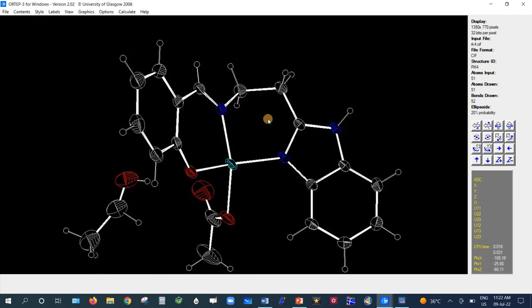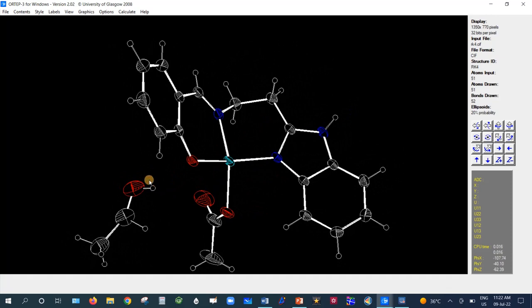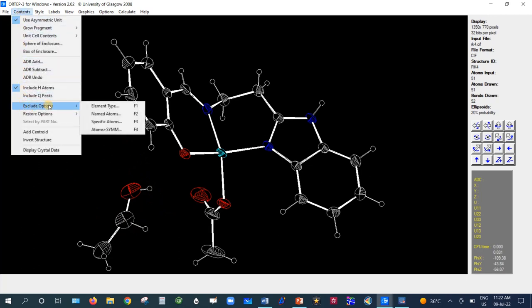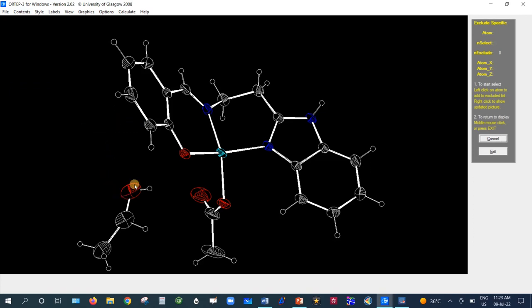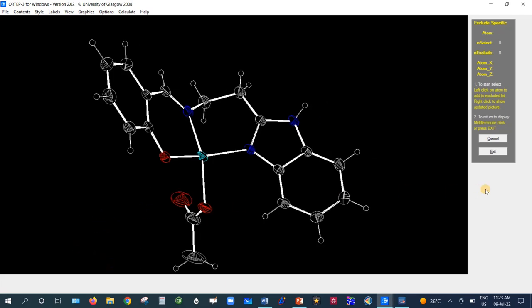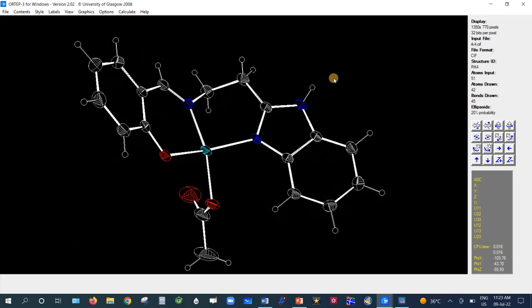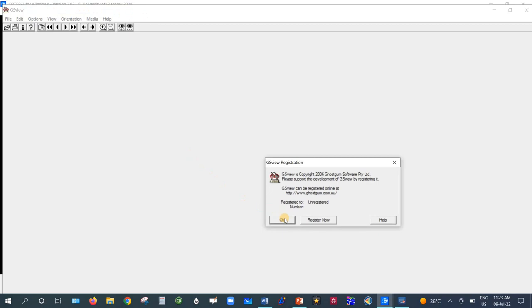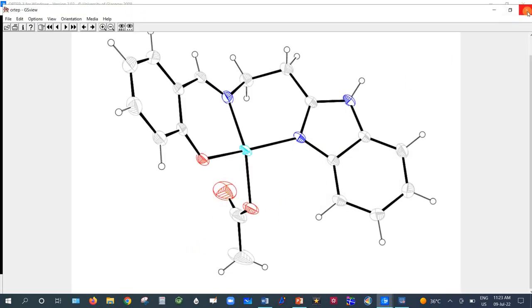Sometimes we want to exclude certain atoms from the molecule display. For example, if there is a solvent ethanol molecule you don't want to display, go to Content > Exclude. You can exclude by element type or by named atom for specific atoms. Left-click to select an atom, then right-click to exclude it. After pressing Exit, the excluded atoms are removed from the diagram, and writing a new PostScript color file confirms the ethanol molecule is no longer shown.